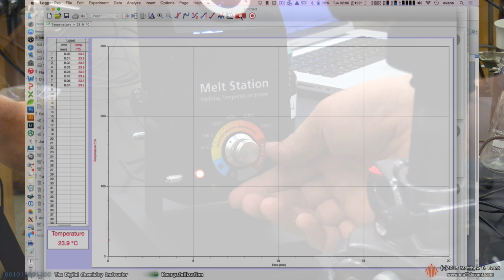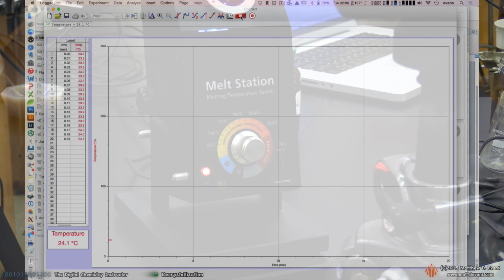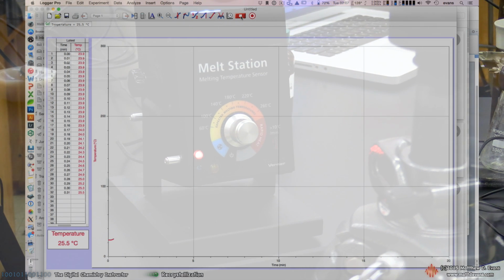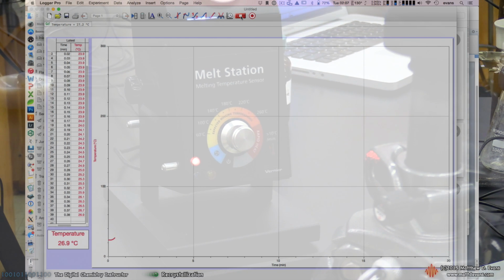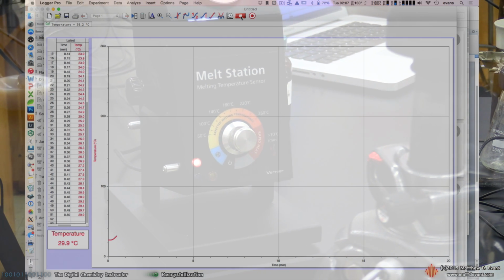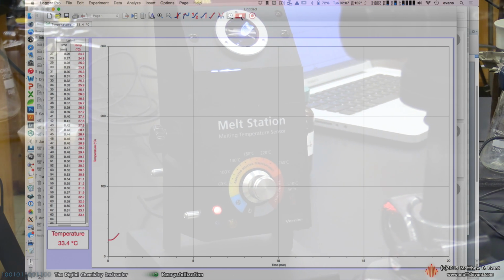Again, what this is going to do is heat up the samples. Actually, I'm going to go way past 165 just to get this whole ball rolling. I want the temperature to rise quickly in the beginning. With the melt stations it goes pretty quickly, so I'm going to stop about 10 to 15 degrees before it gets to my melting point temperature and slow it right down. The way I'm going to slow that down is I'm going to turn it to what it should be, and that's 165 on this dial. So right now we're going to have to wait a little bit till it gets up to temperature.